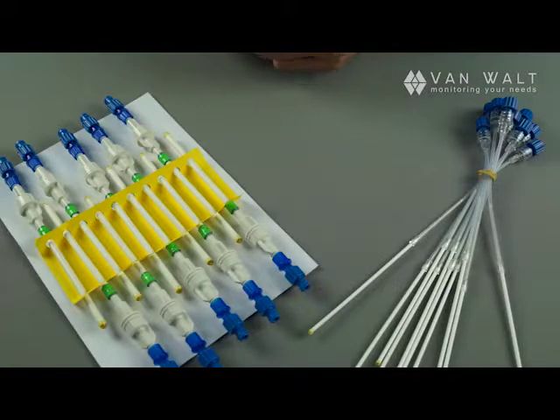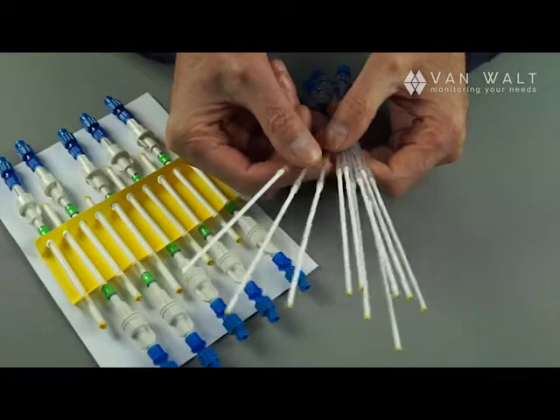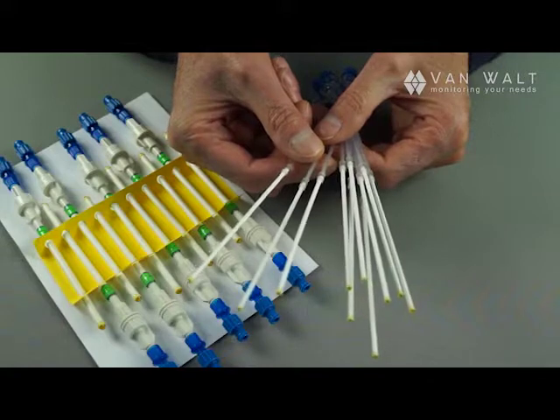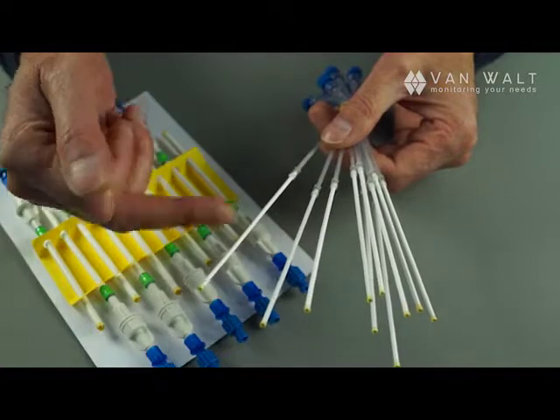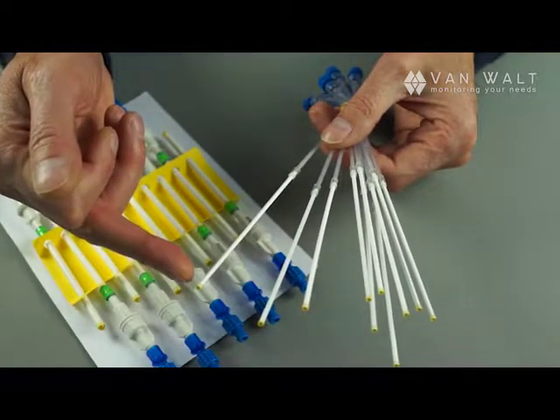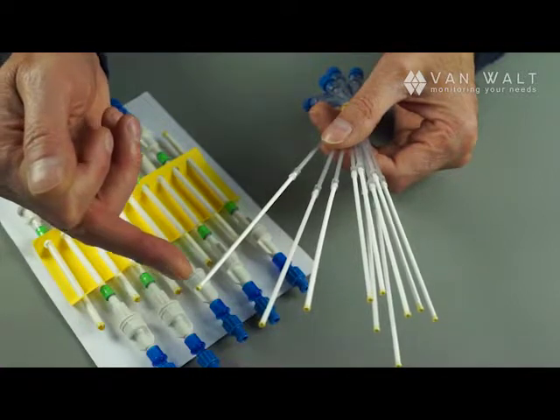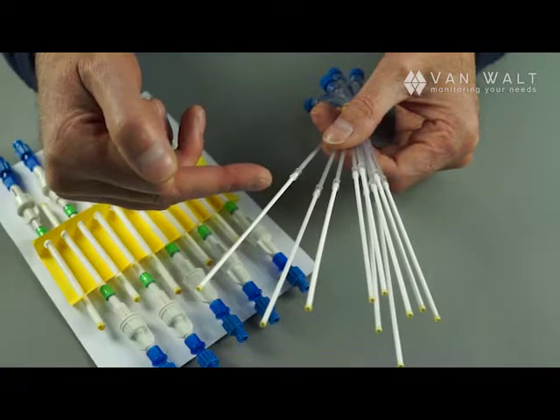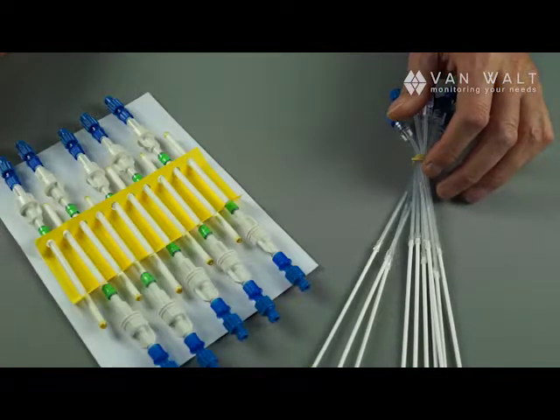They are very small. We have two types. We have the micro rhizomes which are normally used in laboratories for soil profiles. They are 10 centimeters long and have a diameter of just two millimeters. The white section is a porous polymer. The micro rhizomes are used to take very small sample volumes, usually below 10 milliliters.